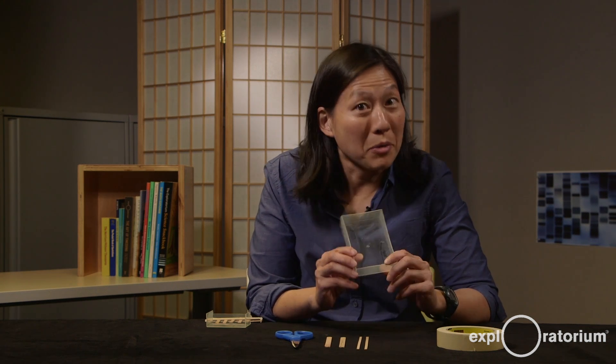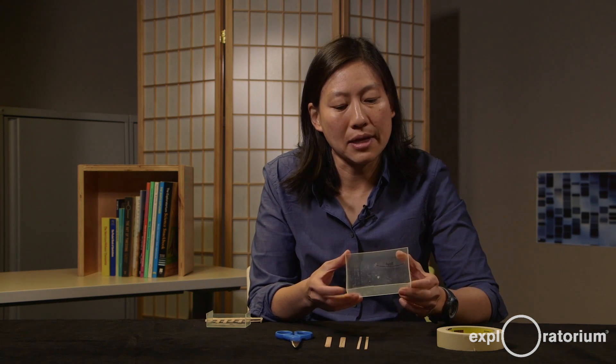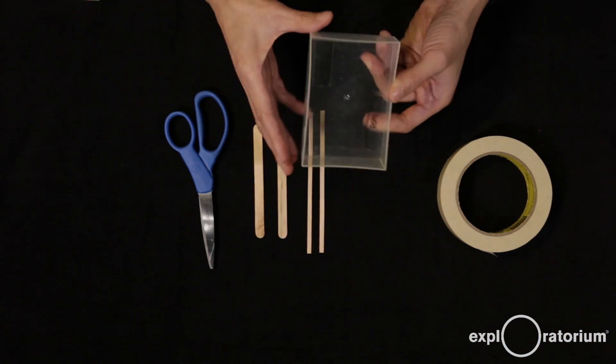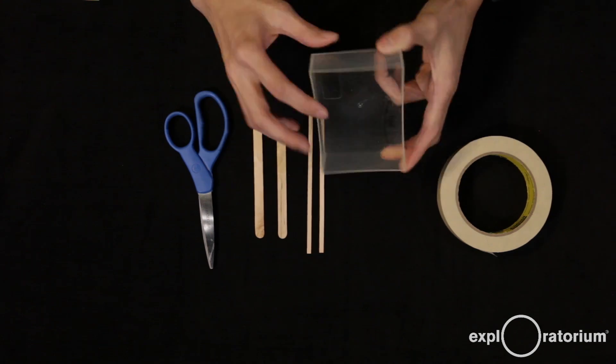You can buy jello electrophoresis chambers, but they usually cost a few hundred dollars. We're going to make one for under five bucks. The way we're going to do that is to use discarded materials. The first thing is the chamber — the thing that holds all your samples — and I'm using a rectangular plastic box that doesn't leak water.